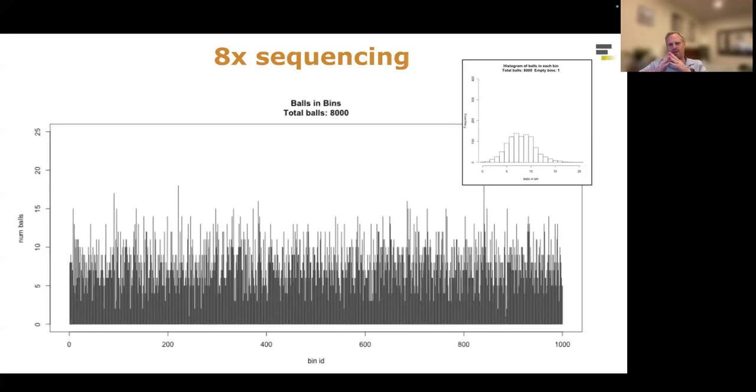So you would expect, within 2 standard deviations, that your genome coverage will be between, say, 80 and 120x if you've targeted 100x coverage on average. So that Poisson distribution underlies all the analysis that you're going to do about how much coverage to generate and how we should think about what that coverage spread is going to look like.